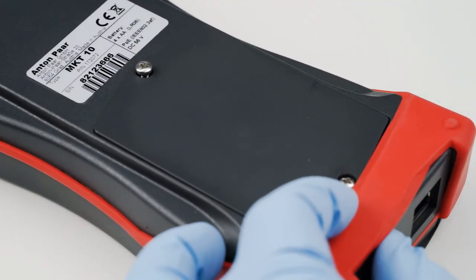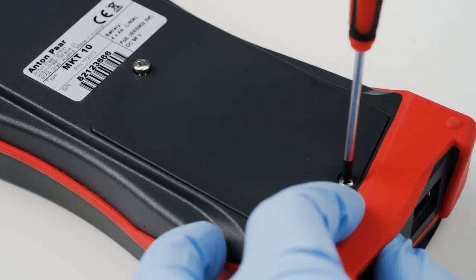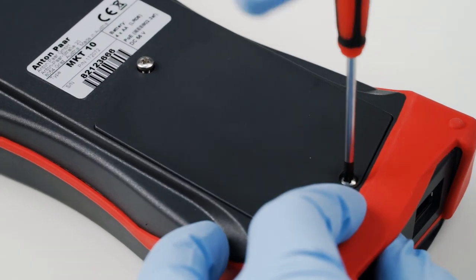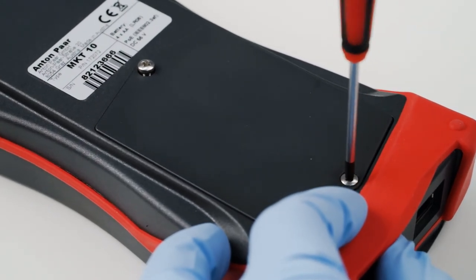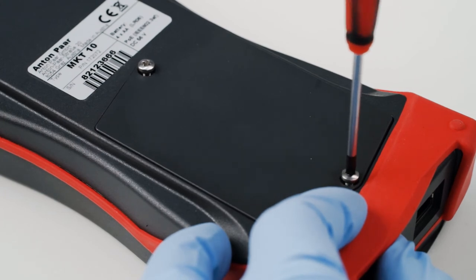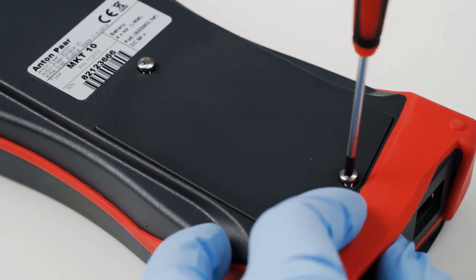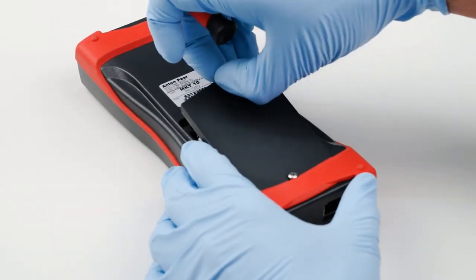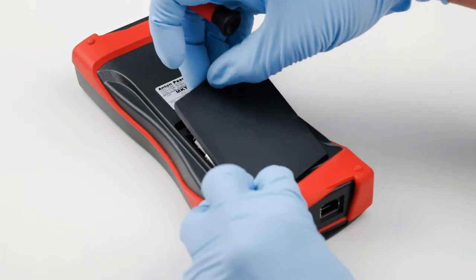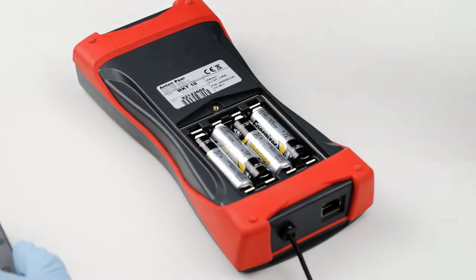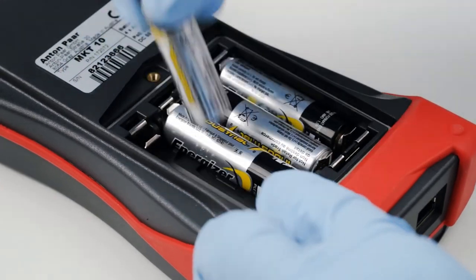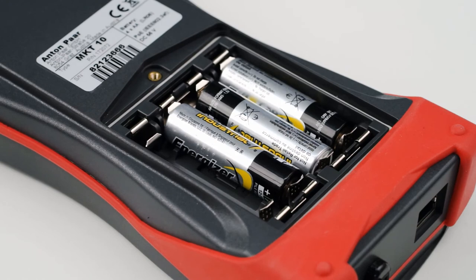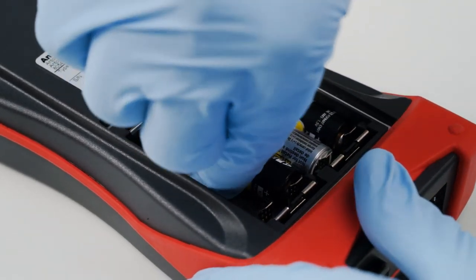To reach the bottom screw, you need to push the red housing seal aside. Remove the discharged batteries and put in four new alkaline batteries.